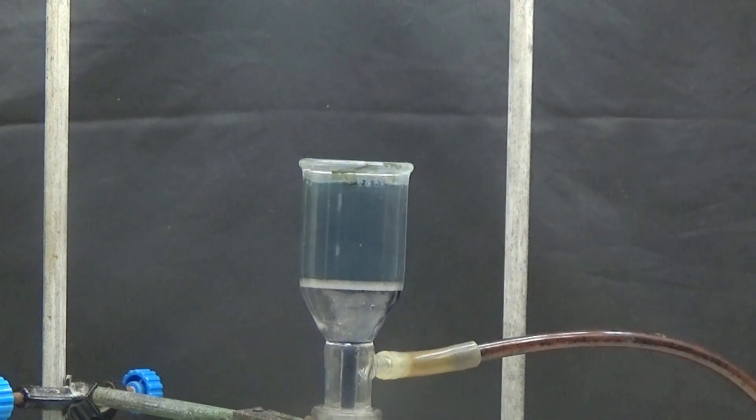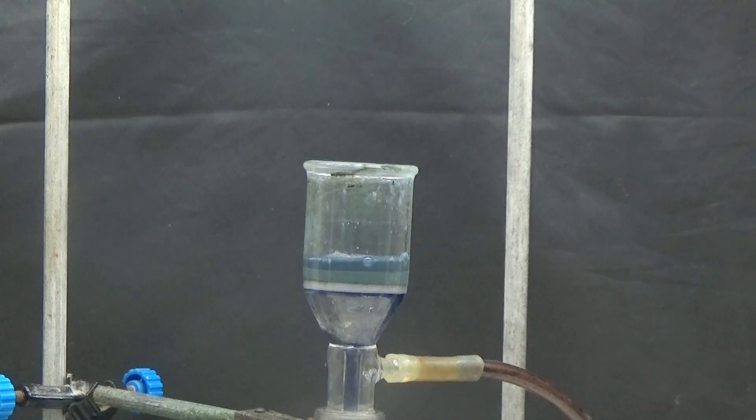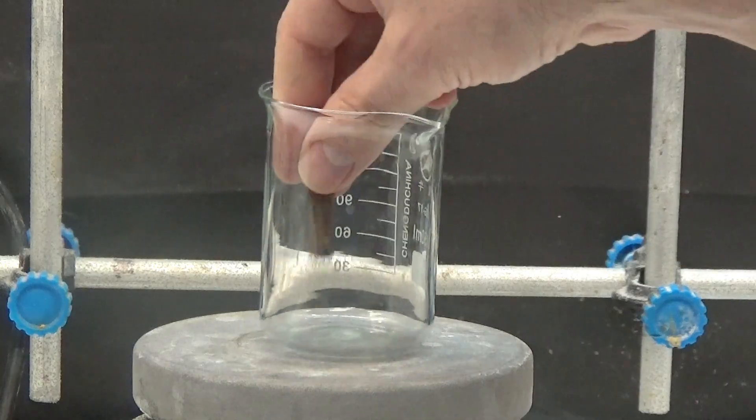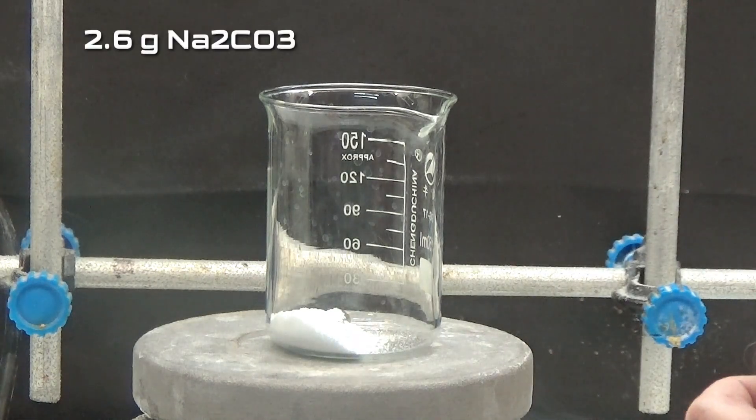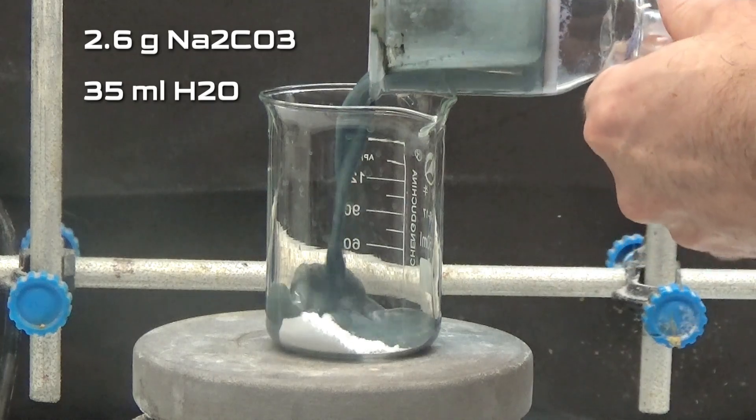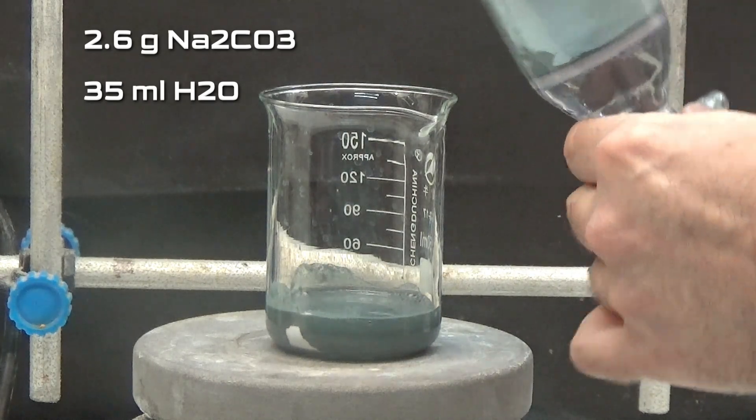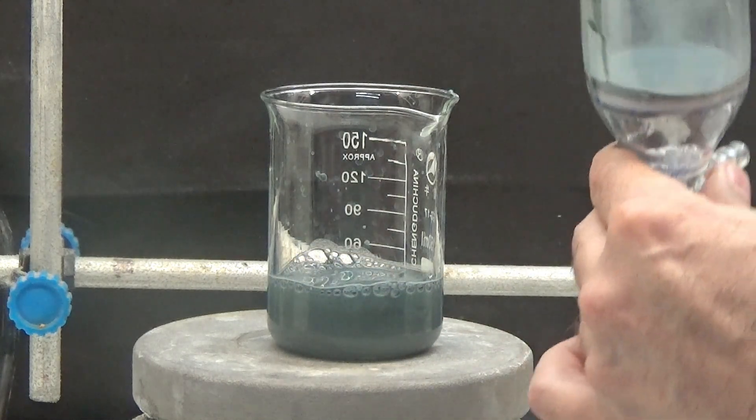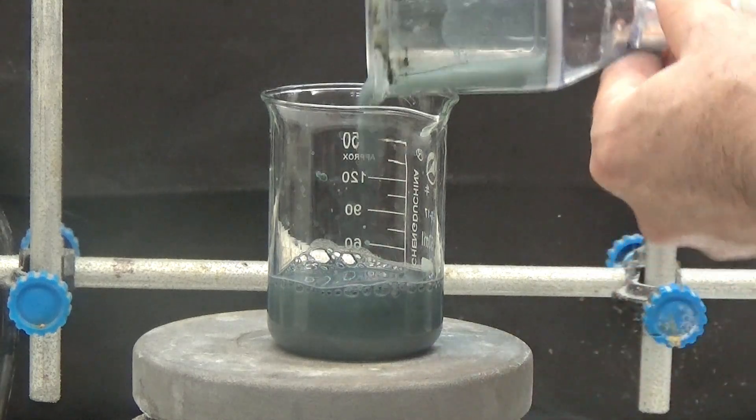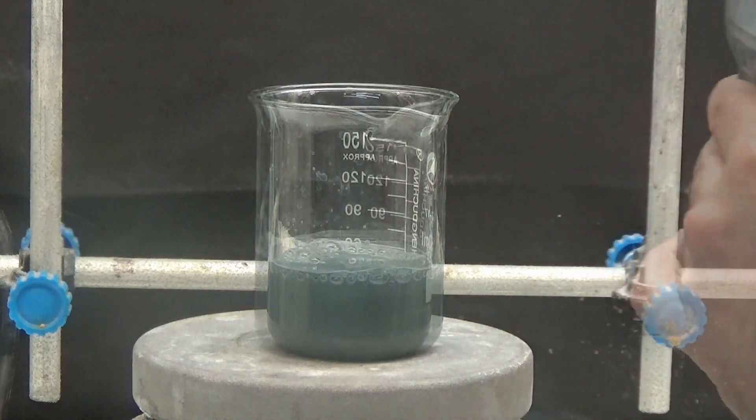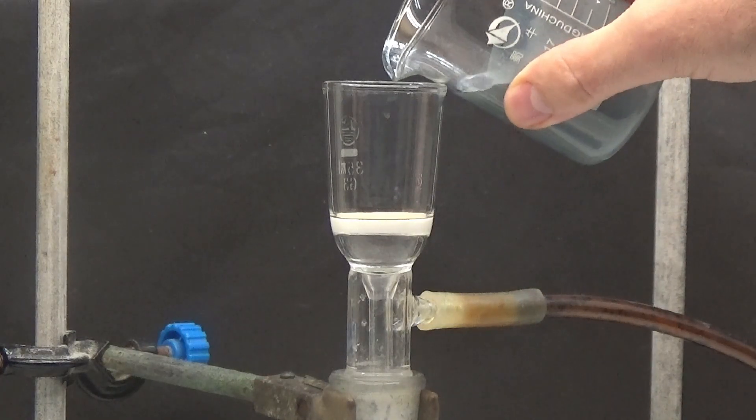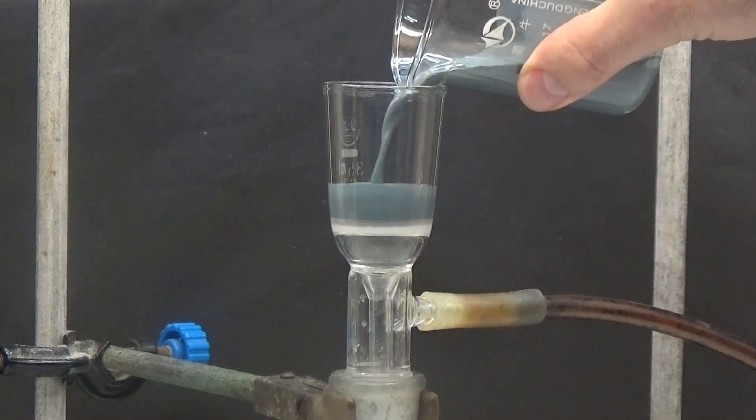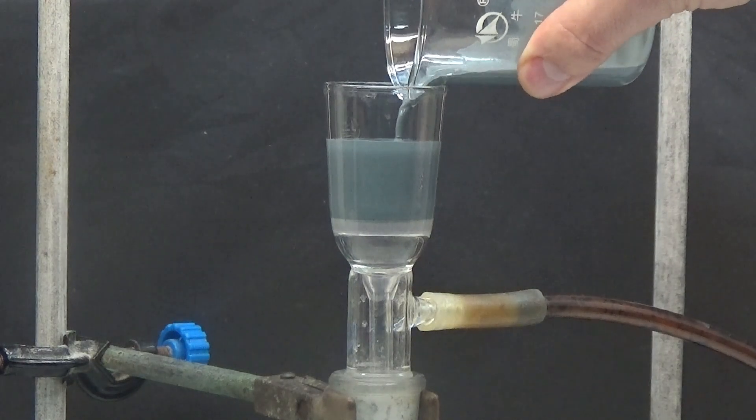Once cold, the precipitate is collected again by suction. The cake is dispersed in a solution of 2.6 grams of sodium carbonate diluted in 35 milliliters of water. This is done to remove the unreacted phenylanthranilic acid. The unreacted acid forms a water-soluble salt with the carbonate that passes through the filter.